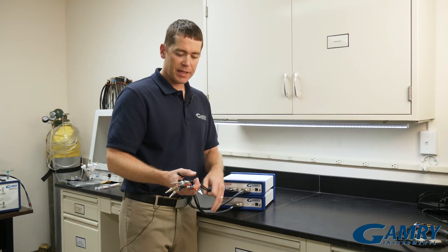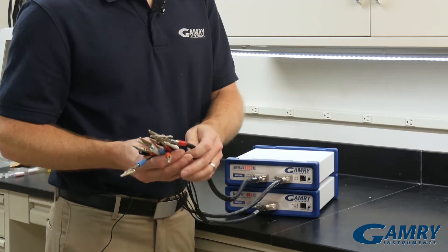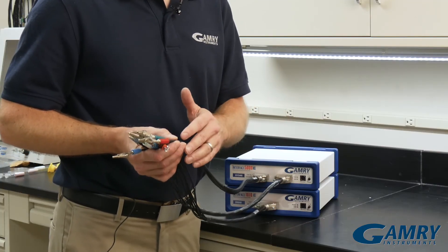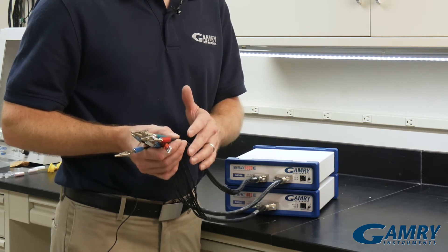Now you've made a bipotentiostat. All you have to do is hook your leads up together to share your counter and your reference, and you have your two working electrodes — and you're all ready to start running experiments.